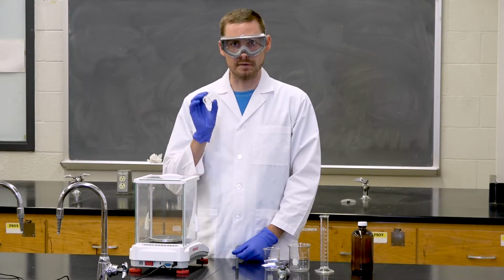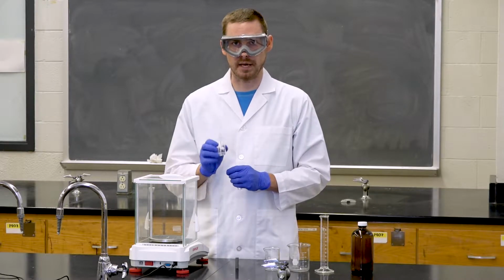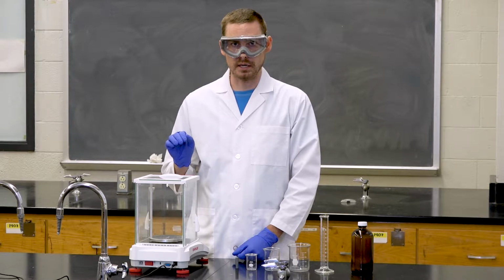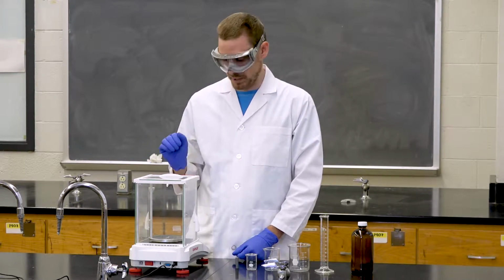First, we're going to learn how to measure a sample of water using the analytical balance and how to subtract the mass of a beaker from the mass of the water plus the beaker together so that we have just the mass of the water. To begin, make sure the balance is on and that it is level. If it is not level, please ask your TA for help to level out the balance.